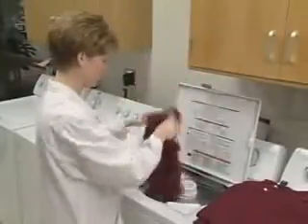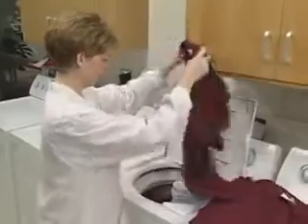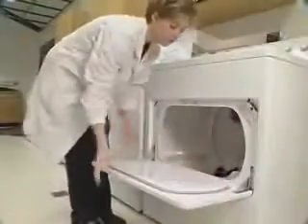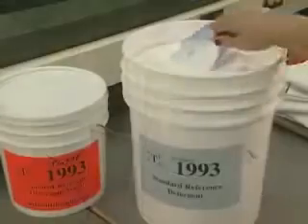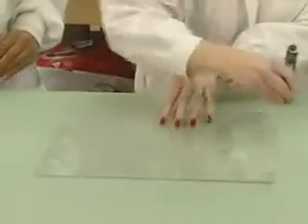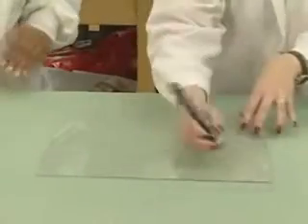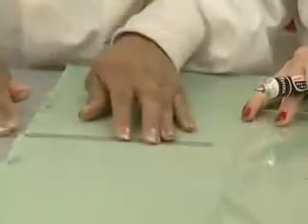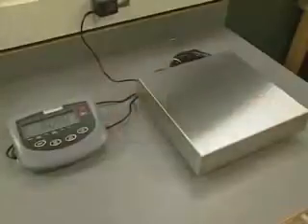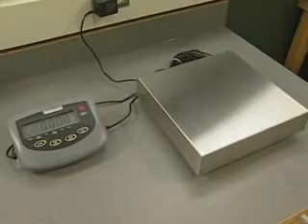The materials and equipment needed for this test include the following: an automated washing machine, an automated tumble drying machine, standard laundry detergent, ballast cloth, an indelible ink marking pen, a 15-inch by 15-inch template cutting guide, a ruler or measuring system that yields direct shrinkage numbers, and a weighing balance or scale.